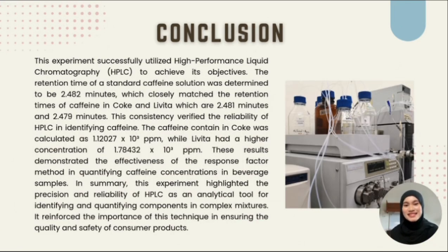So this experiment successfully achieved its objective. The retention time of standard caffeine solution was determined to be 2.482 minutes, which closely matched the retention time of caffeine in Coke and Nivita. This consistency verified the reliability of HPLC in identifying caffeine. The caffeine contained in Nivita had a higher concentration than caffeine contained in Coke. These results demonstrated the effectiveness of the response factor method in quantifying caffeine concentrations in beverage samples.